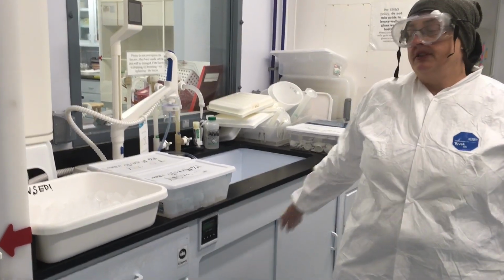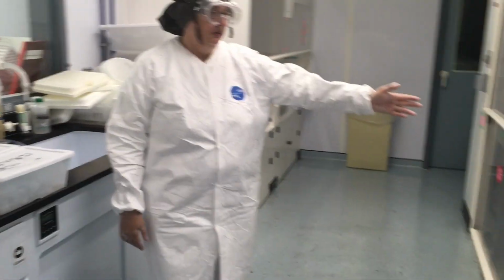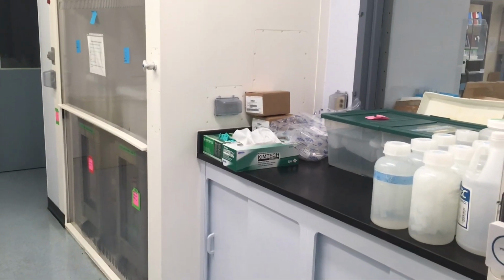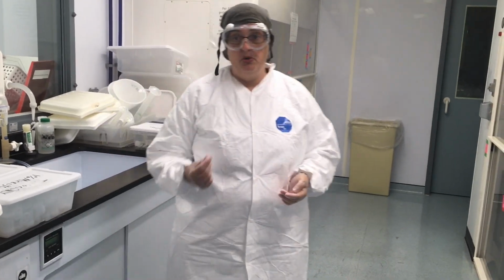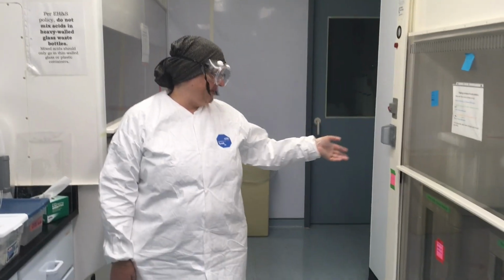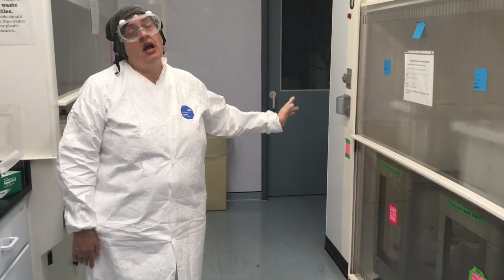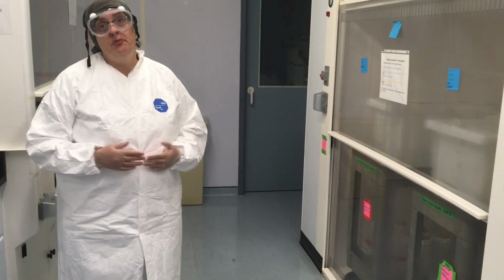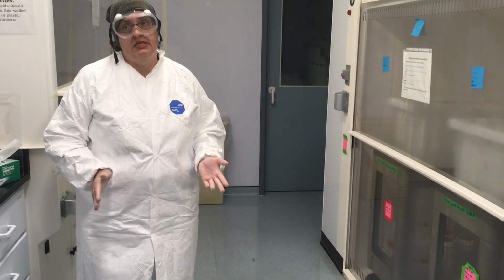So this is basically our semi-clean lab where we do a lot of our sample prep. So for instance, over here, we start cleaning things. Everything that comes in new to the lab usually gets cleaned. So first it'll be cleaned in soapy water to remove any residues. Then it gets soaked in 20% nitric acid. It gets rinsed thoroughly and then soaked in 20% hydrochloric acid. And the reason for that is different metals have different solubilities in different acids. And by using several different acids, we're going to get our blanks as low as possible.